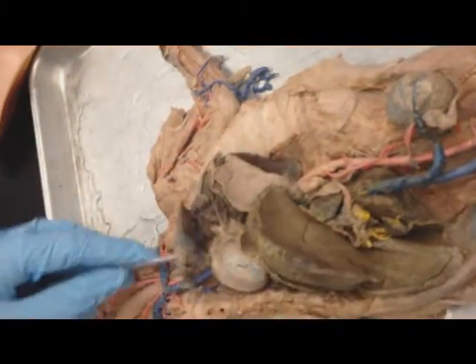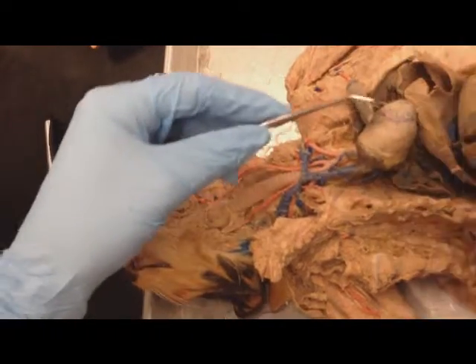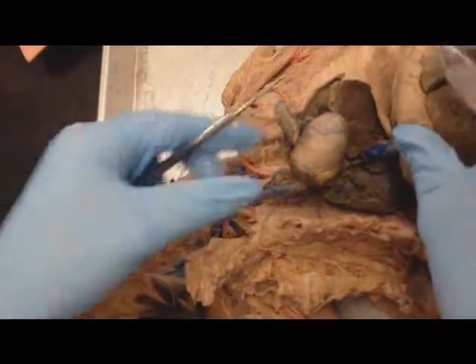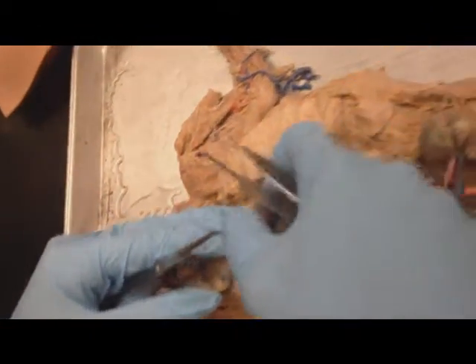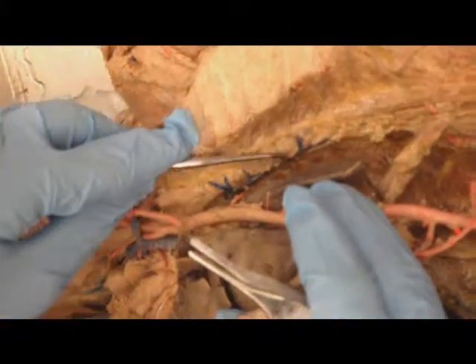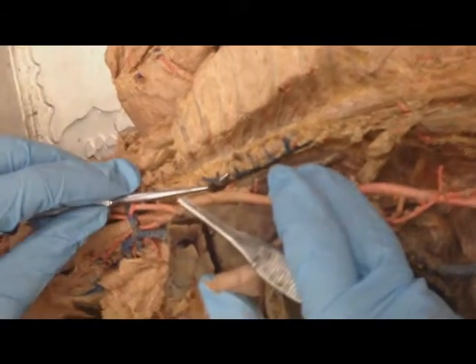Okay. Now, this here is going to be your superior vena cava. You also have an inferior vena cava. And these are the veins, so just add the word vein. If you kind of pull the viscera back, you'll often find this vein running along the spine. Sometimes it's detached. It's called azygous vein.